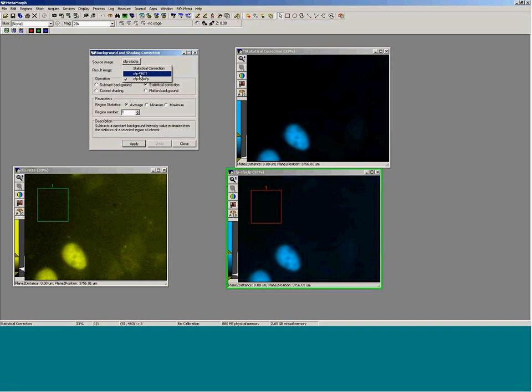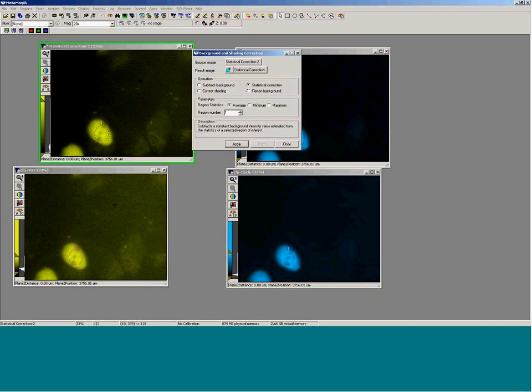There are several other ways of calculating FRET, photobleaching being one, where you don't need to do the bleed-through calculations. If you only have the one sample to deal with, you won't be able to correctly do the FRET calculations through the specified bleed-through or the sensitized emission. So, like I said, there are several other methods for doing that.